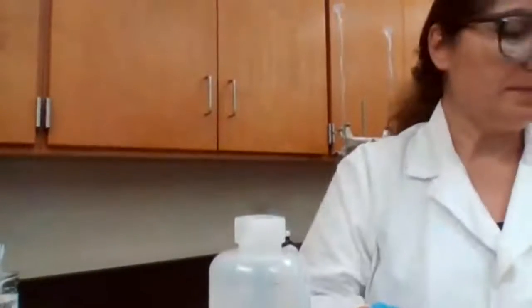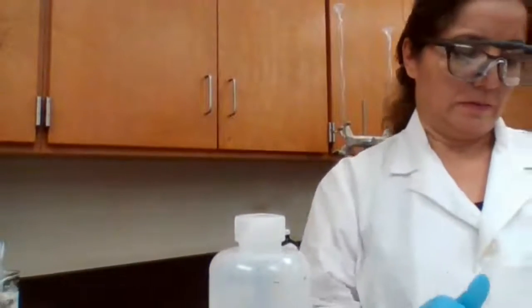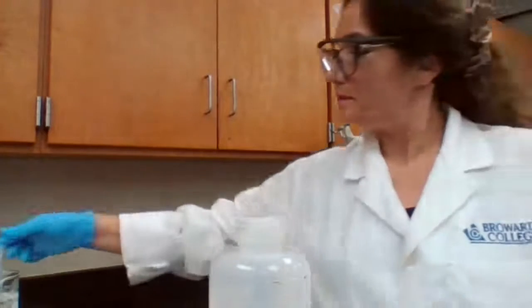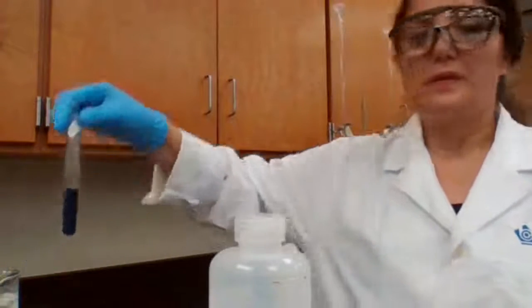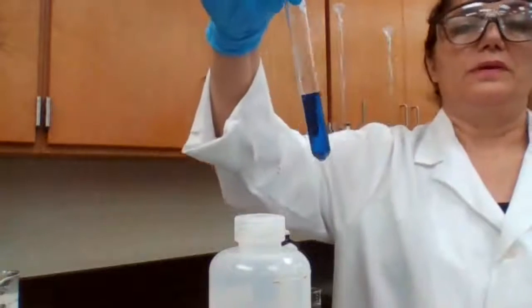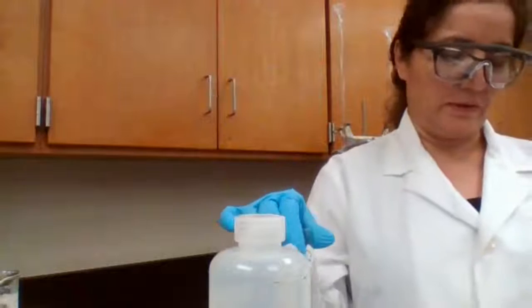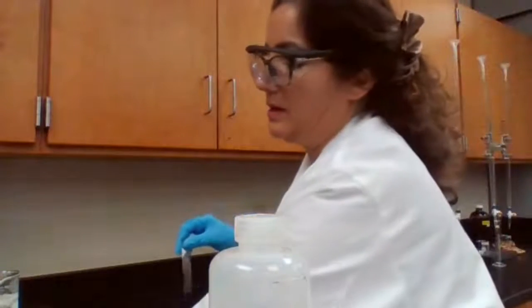Record your observation, please. This is after heating up in the hot water bath.